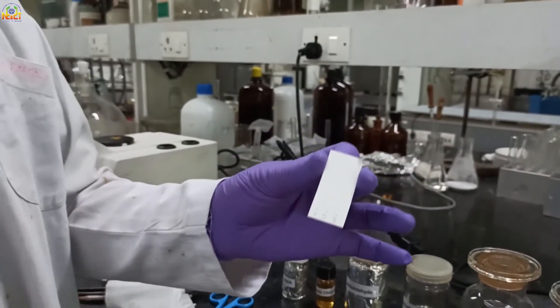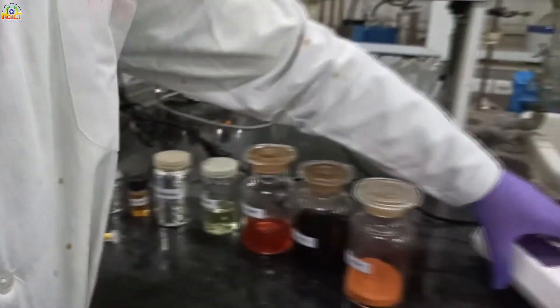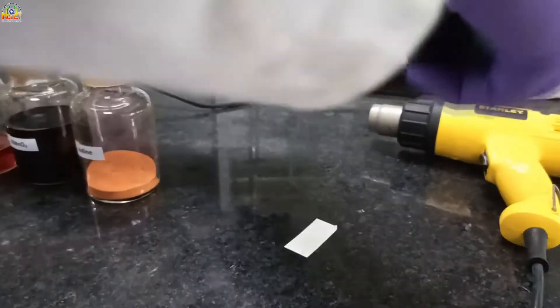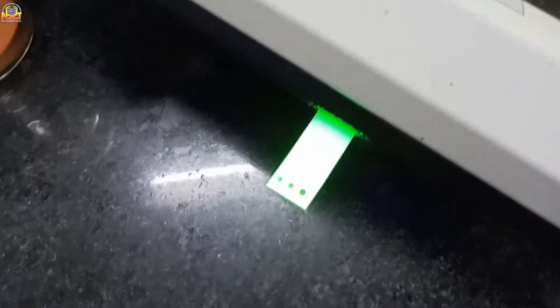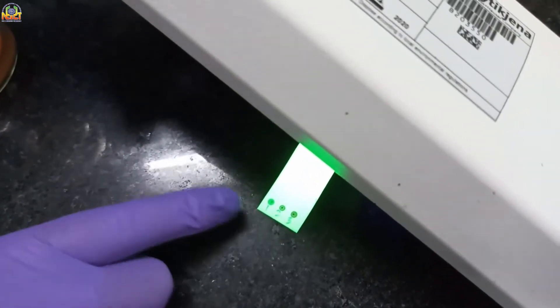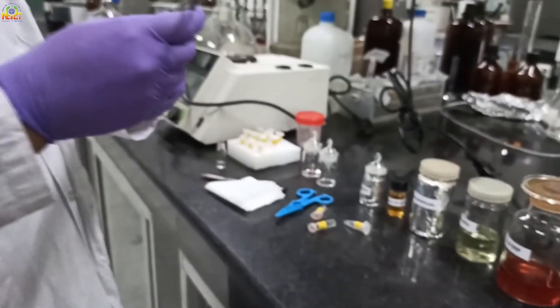Now I will run this TLC in an appropriate solvent in the TLC chamber. If you want to see whether spots are spotted on TLC or not, I am going to show this TLC under UV light. Look, three spots are visible which are spotted at the base of this TLC plate.